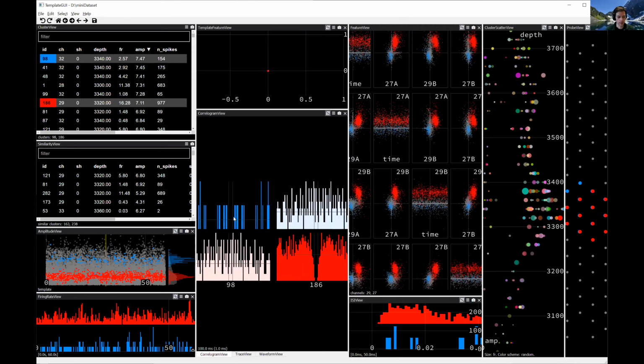So this is an important point about using the Correlogram, which is that it's only useful as far as you have enough spikes to get a confident estimate of the Correlogram. And for this blue neuron, I would really not say that you have that many spikes. So you can help yourself here. First of all, it's going to do better for high firing rate neurons, but you can also help yourself by having longer recordings.